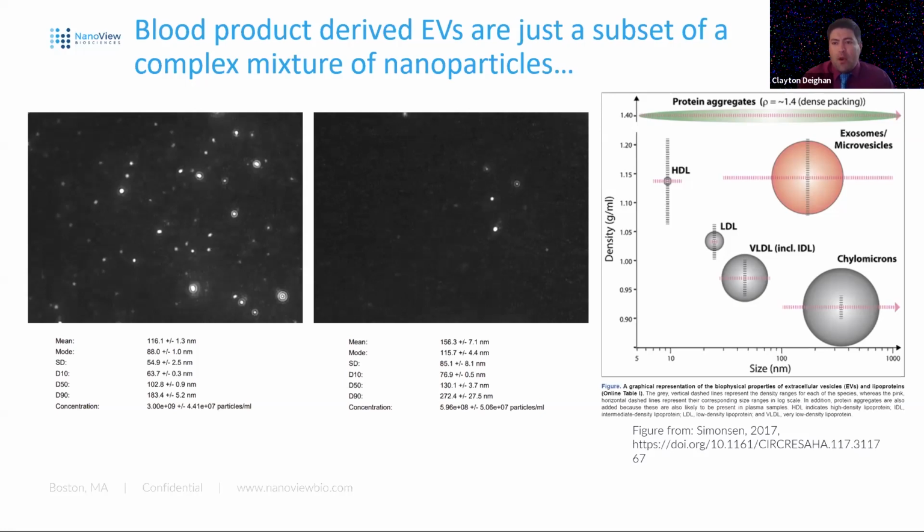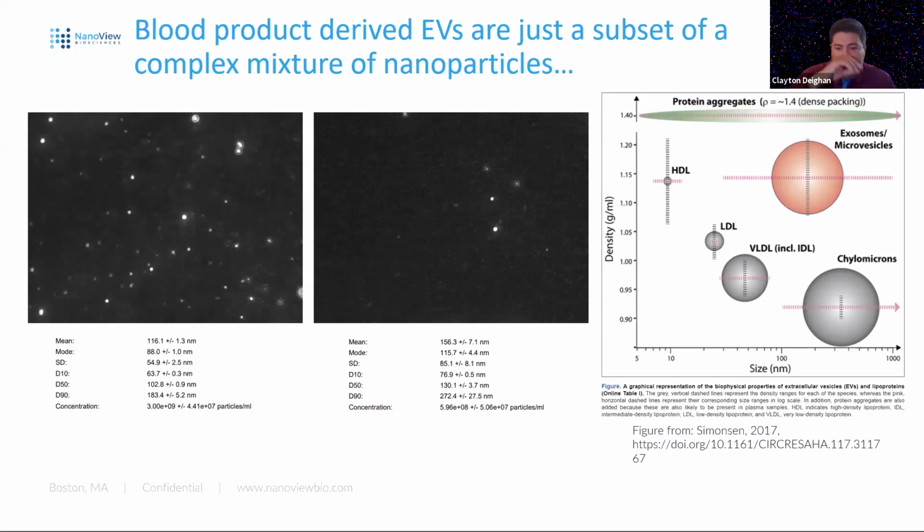What do we really know about the particles from there? This is where assumptions come in. It's easy when you look at some of these types of data to say, okay, I can see all my nanoparticles there, and I would like to imagine I could label them all for a marker of interest. I think it's often difficult to do. Here it's intuitive that you could put the filter in the way and see the particles, but it's not usually successful for sensitivity reasons, or perhaps because in some cases you can be looking at many nanoparticles that aren't in fact EVs if you don't have a positive tag on them when you have a complex mixture. So keep that fact in mind, and we're going to explore that a bit more as we go on here.